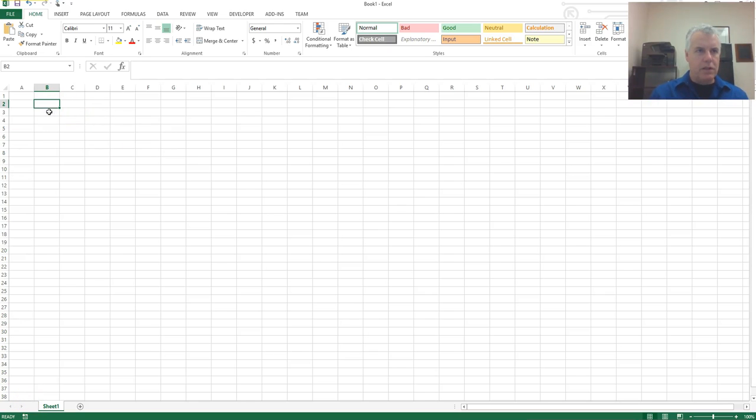Okay, so this is Chem 101, Fall 2015, and I'm going to go over the creation of the snazzy FTIR workbook.